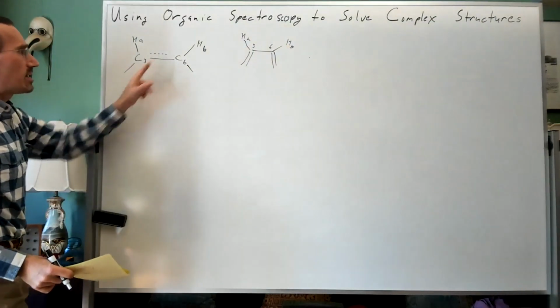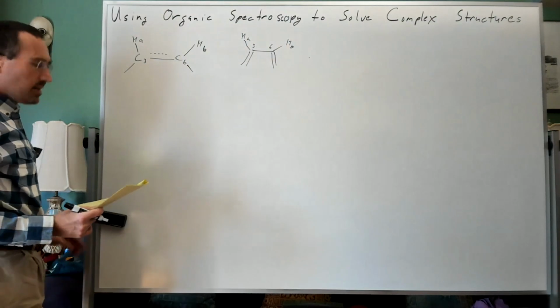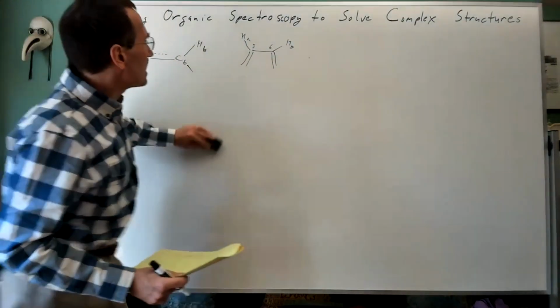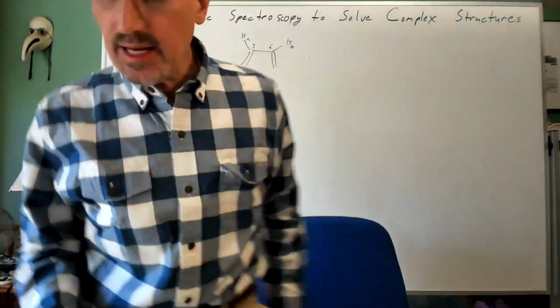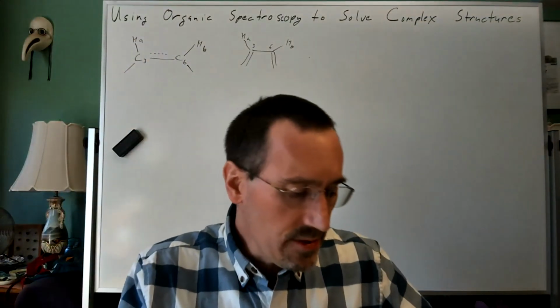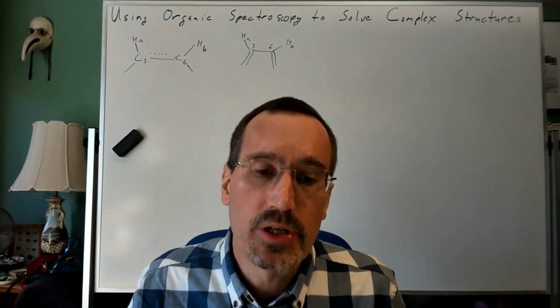But no matter what, these two carbons certainly are alkene carbons. So anyway, that's what's on my mind when I see that cross peak. All right, let's get into the rest of the COSY, and I'll go to the next page for the expansion.